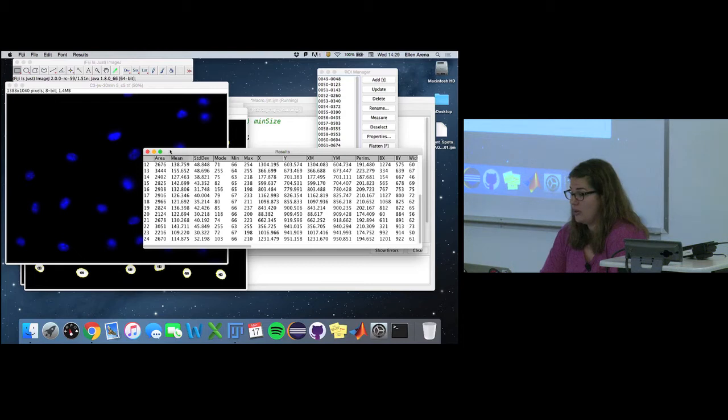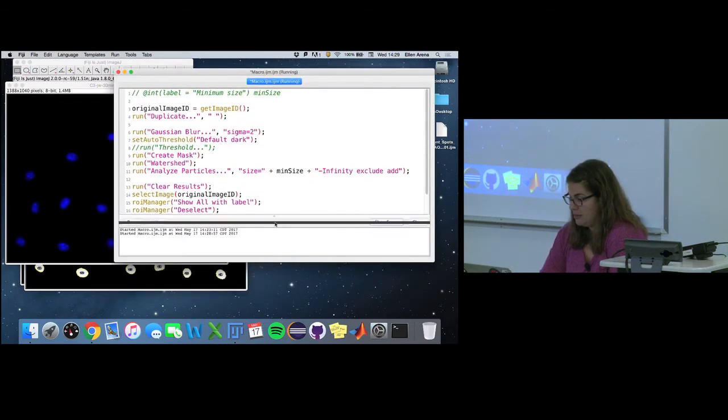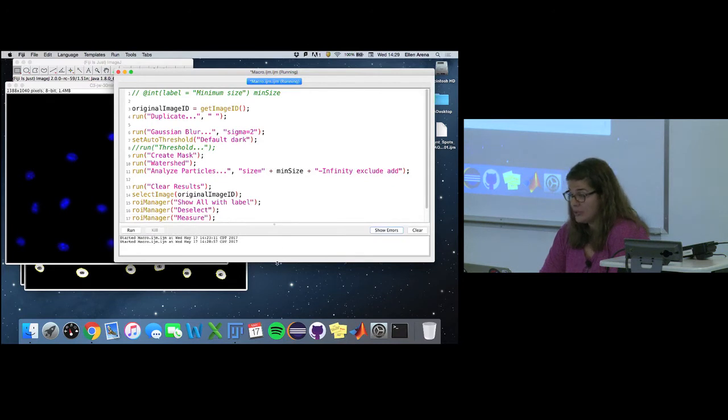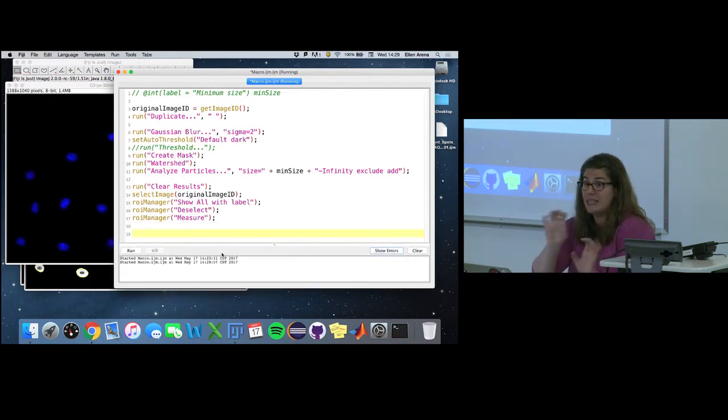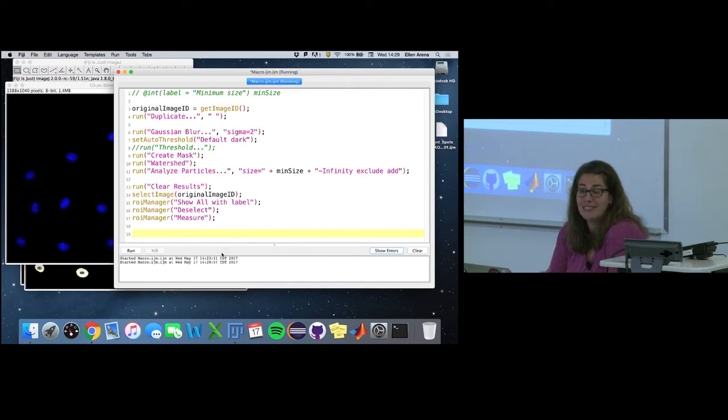Do you want to see the code again? Yeah. And don't stress too much, because all this code is also written in the slide. Unfortunately right now it's really tiny in the slide, but it's there, right? So you can always go back to the slides later on. If something's amiss right now, don't stress too much. You can always go back, and you can watch this video presentation again down the road. Okay?